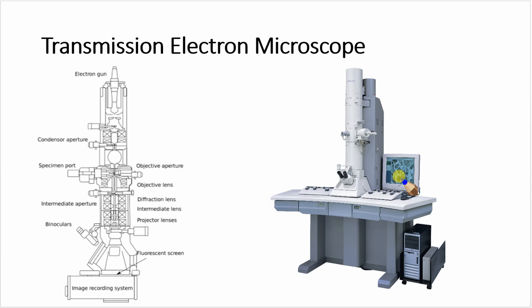It requires a technician to operate this, so no one can just rock up to this machine and expect to use it. It requires a trained technician. Quite costly to use, and there's usually a bit of a queue for you to get on to use this electron microscope. Another difference is you've got your image on an LCD screen, although some of the more powerful light microscopes have exactly the same now.